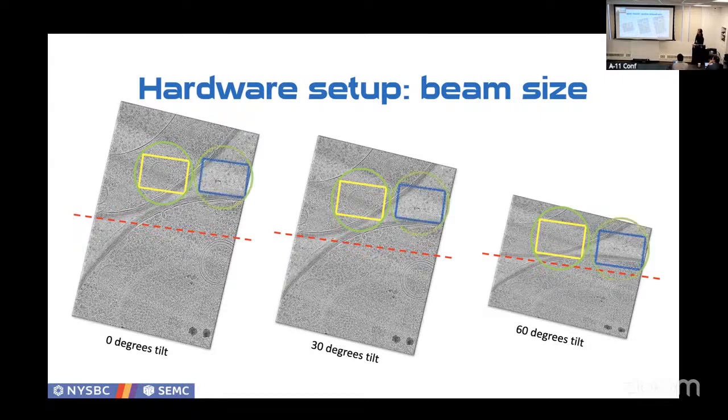And the second problem, you usually need a second tilt series, a tracking tilt series, and in this case, we can put it somewhere in a nonsense region, hopefully. This is the tracking. So you don't want to adjust your parameters because of stage imprecision. You need the tracking tilt series, and you don't want to track where you image. So you have to separate the tracking area from the data acquisition area, and this is the classical way of doing it. For every acquisition area, you have 1 tracking area. There are ways around it, but keep in mind that only a quarter of your lamella with this setup can be imaged.